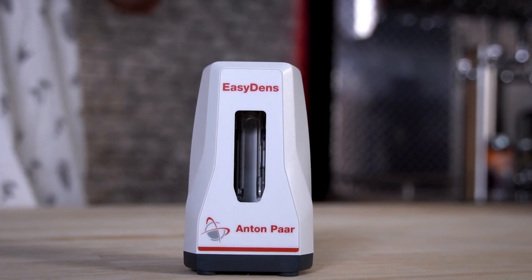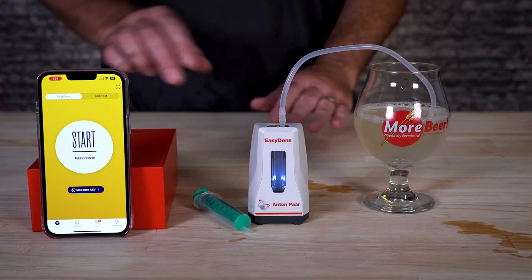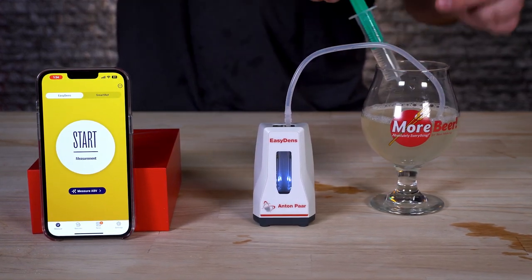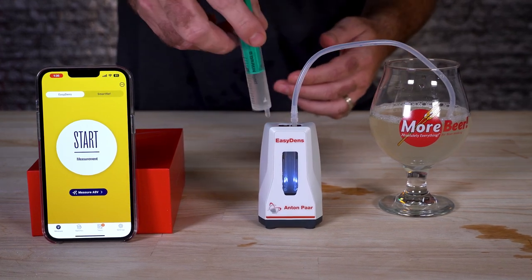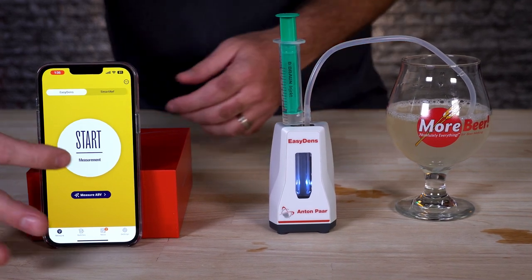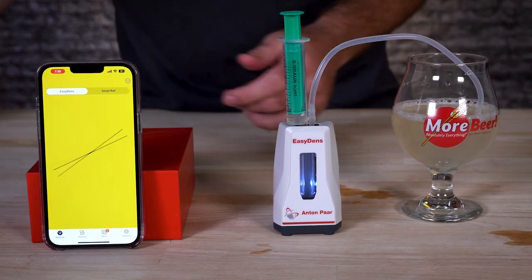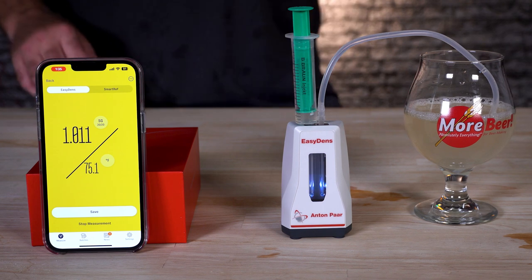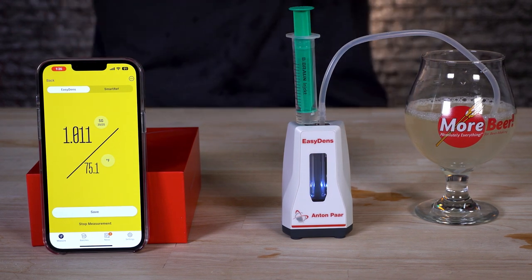Once you have the device all set up, it's time to take a measurement. It's super easy. If you're doing it pre-fermentation, just make sure that it's cooled down slightly. Then you're going to take that 10 ml sample, push it through to fill the little glass chamber that's inside there, and hit start measurement. It's going to go ahead and take your reading and tell you the temperature. The thing I love about this is it gives you results in seconds, and it's easy to read right on your screen — you're not trying to find the meniscus on your hydrometer or putting your bifocals on. You could take a screen capture of it or send it to your friends to show them the gravity you hit.